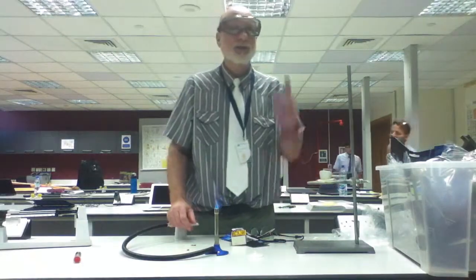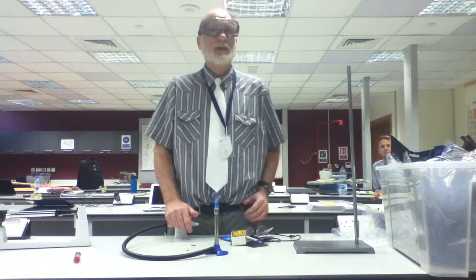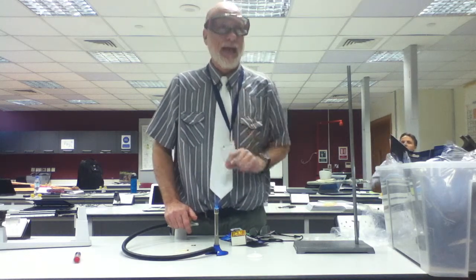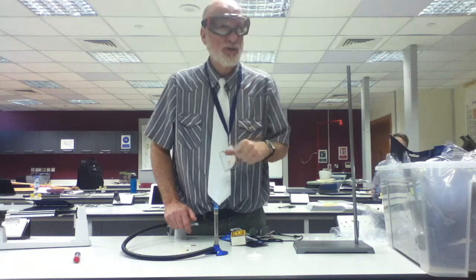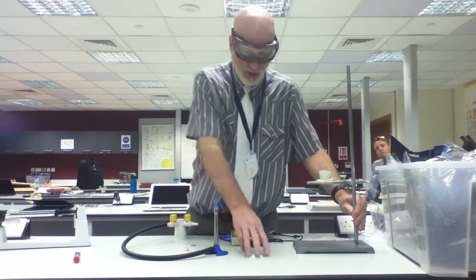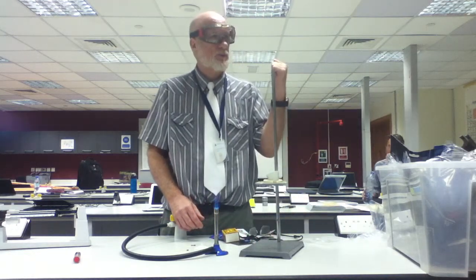Okay, what you're actually doing, yes, Shuckwood. Why did you tell us not to put our finger in it and then you put your finger in it? Because I was trying to demonstrate something and I realized that I'm giving you a bad habit and I don't want you to do that. Do you understand? Yeah. Are you sure? Yes. Would you ever put your finger in the flame? No. Excellent answer.